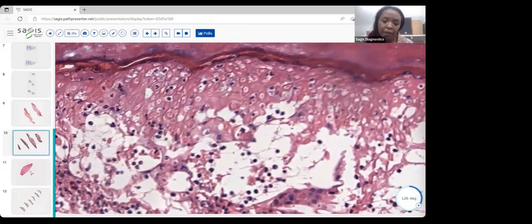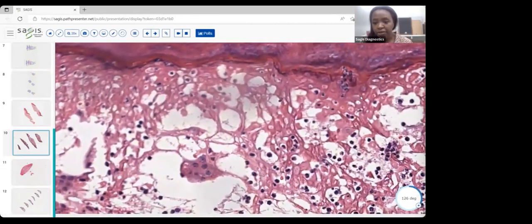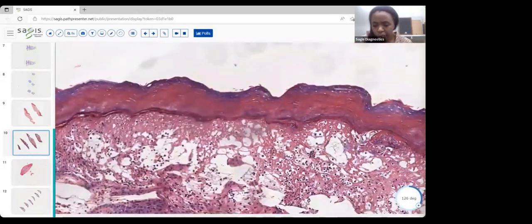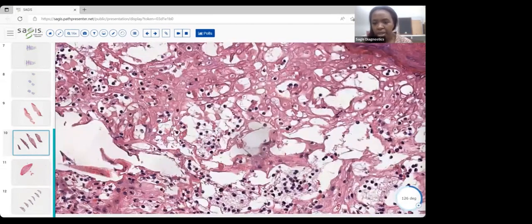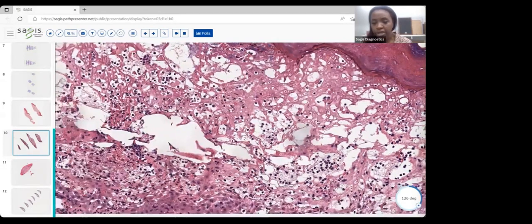Okay, but looking around in this case, you see your keratinocytes, you see all the changes that I mentioned, but there are a few things we're not seeing. We're really not seeing multinucleation. You have the big keratinocytes because of all the fluid, but they're not forming these syncytia. You're not getting multiple cells fusing together, right? So that's something to take note of. Okay, and then we don't really appreciate inclusions per se. Again, it's fluid. It's a lot of fluid that is inside the cytoplasm.